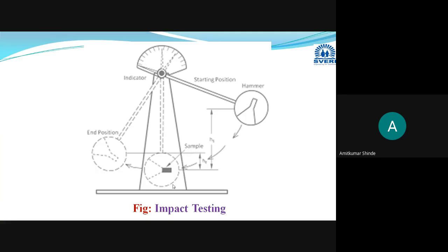I will wait for a few minutes here. Please draw the arrangement which we are using for conducting the impact testing method. Please draw this arrangement. I will wait for a few minutes here. Please complete the drawing, and after that I will explain how this impact testing is conducted and how the tensile impact energy testing is conducted, and what the basic difference is between impact testing and tensile impact energy testing. A very small difference will be there.